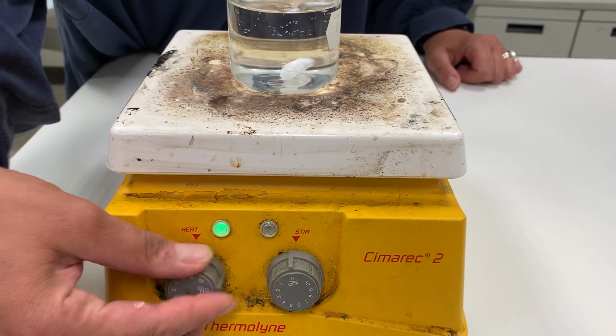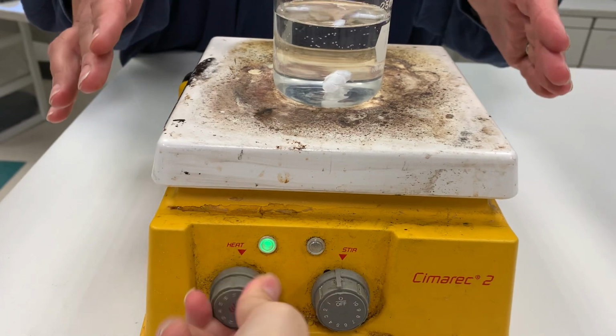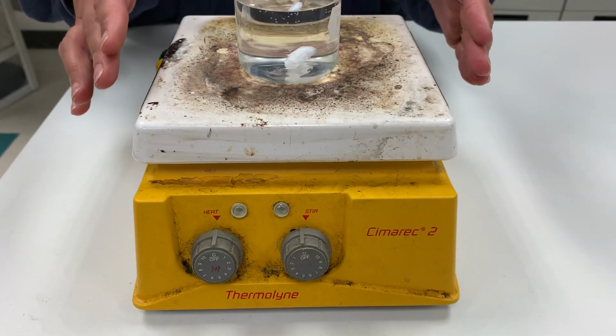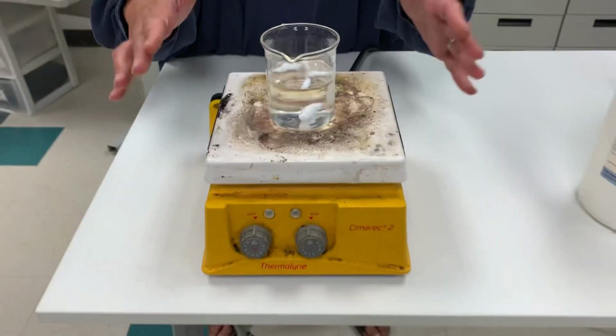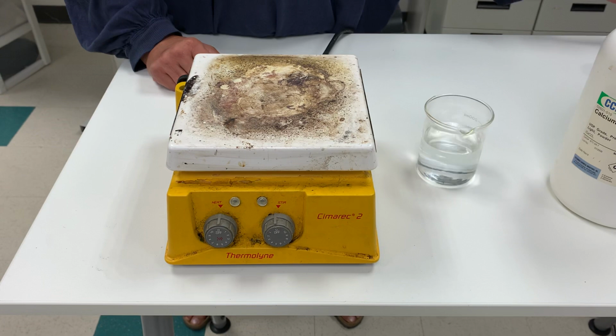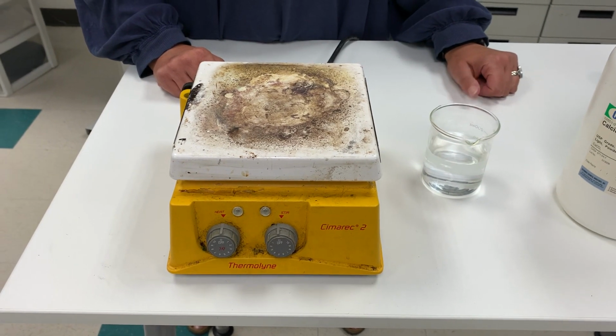When you're all done, make sure you turn them both off. Do not touch the top of this if it's really, really hot. You'll burn yourself. And wait till everything's cool. Then remove this, unplug your hot plate, and you're finished. And that's all the equipment we're going to show you for now.